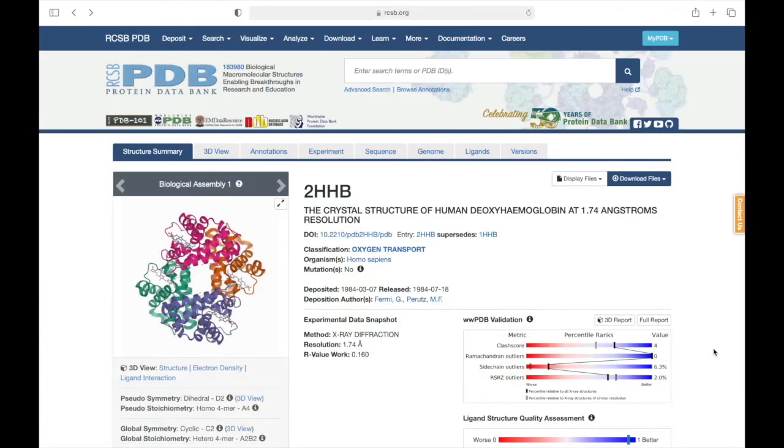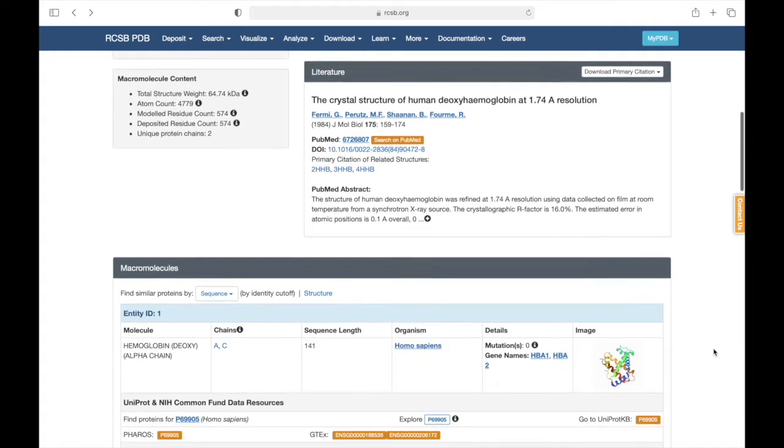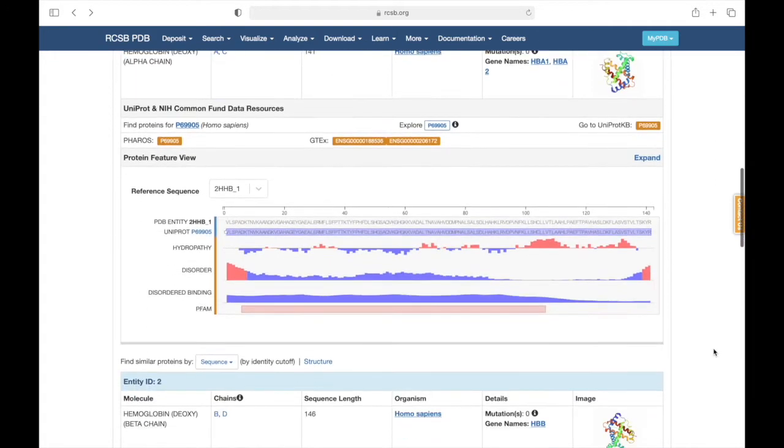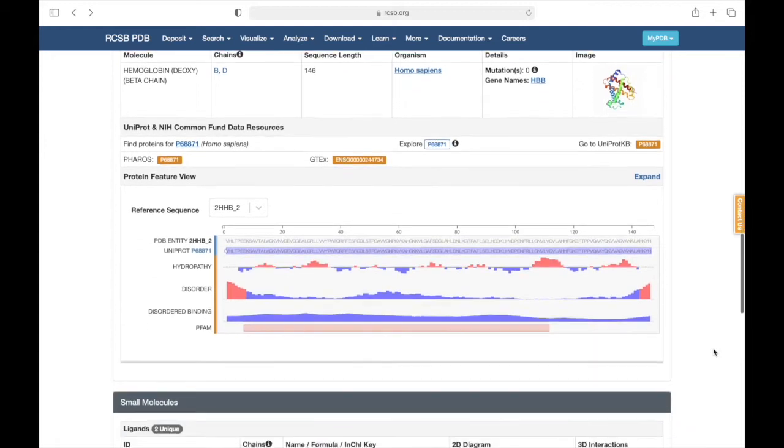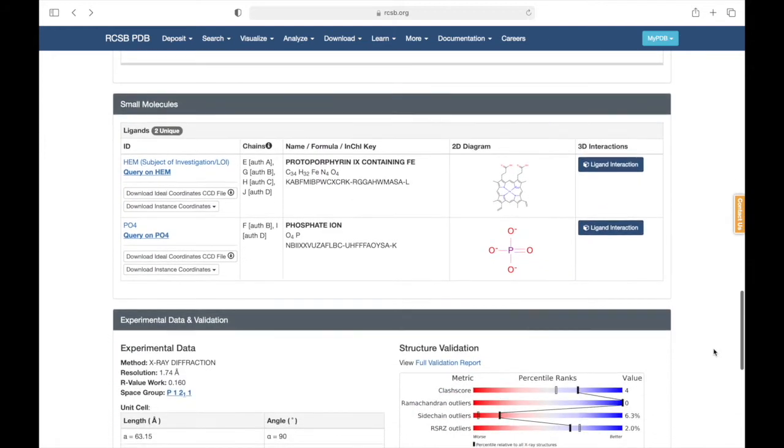Before continuing further, we must first understand the small molecule data on rcsb.org. Scrolling down on the structure summary page of our entry, we eventually come to the small molecule section.